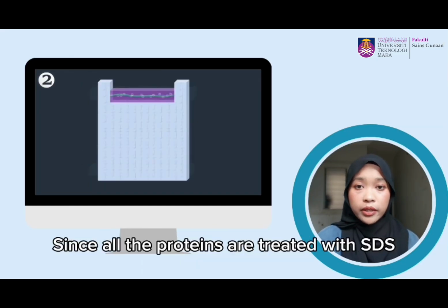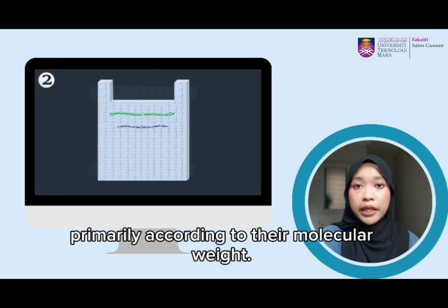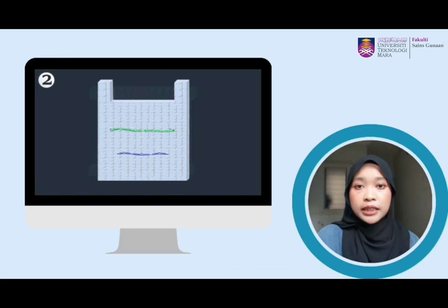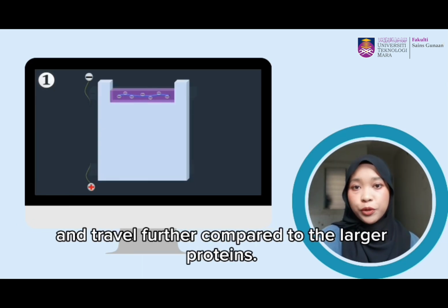Since all the proteins are treated with SDS, they all have a uniform negative charge. So they are separated primarily according to their molecular weight. Therefore, smaller proteins will move quickly through the gel and travel farther compared to the larger proteins.